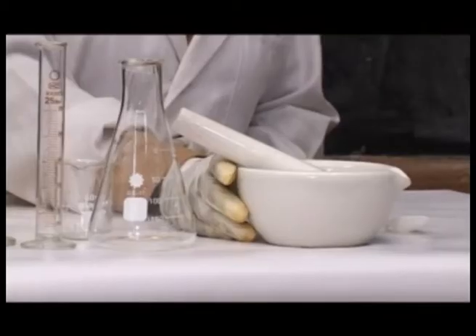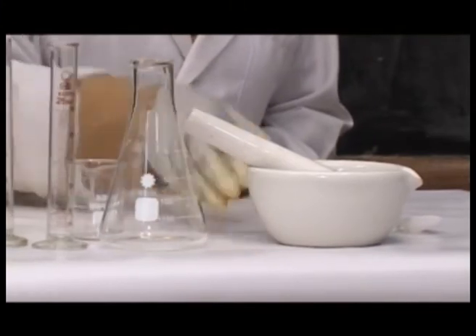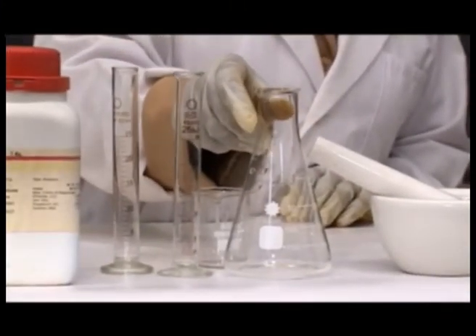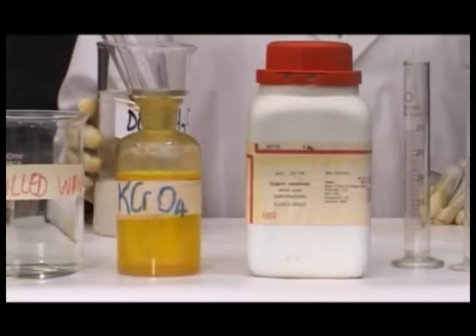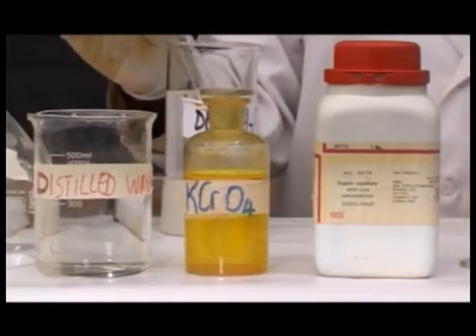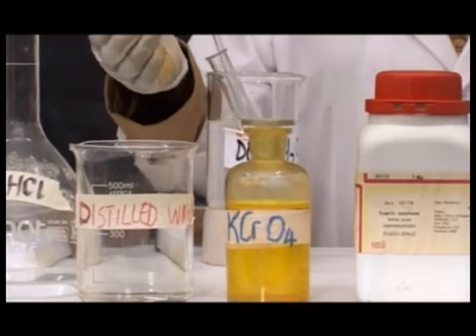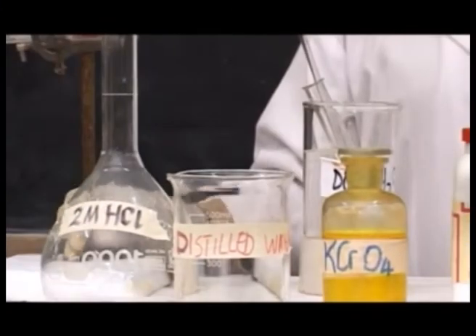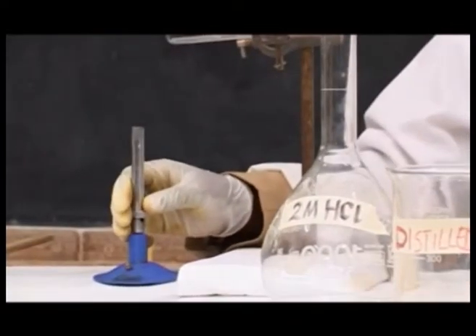Requirements: apparatus, mortar and pestle, conical flask, measuring cylinders, beaker, test tube connected with delivery tube, retort stand, heat source.